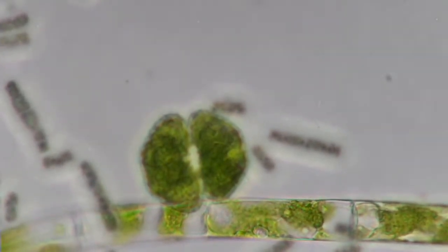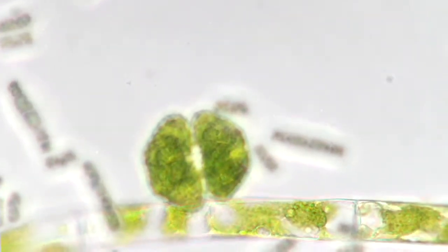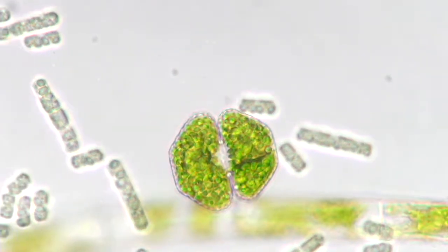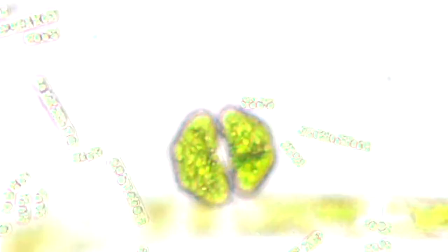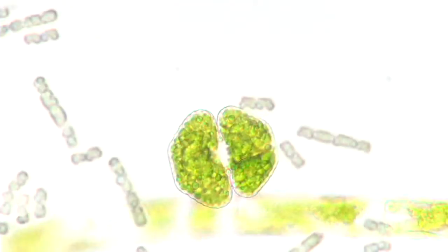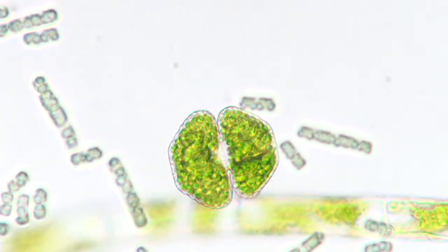Maybe I'll do this and I'll just fix it. Is this the Closterium? Cosmerium. Cosmerium — same as the banana. Oh, okay. Actually, by the way, when you said before that you wanted to get out of here before — Cosmerium? Yep. Cosmerium.